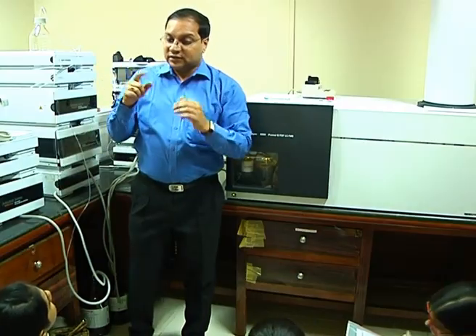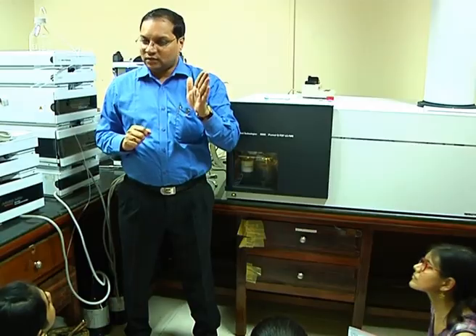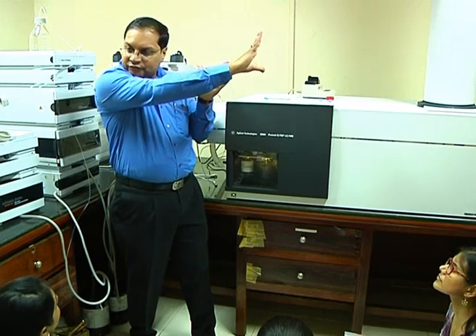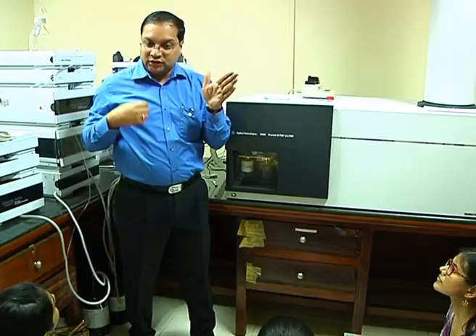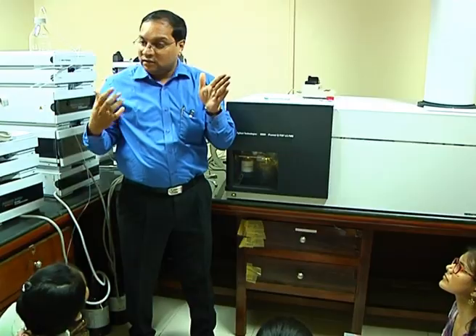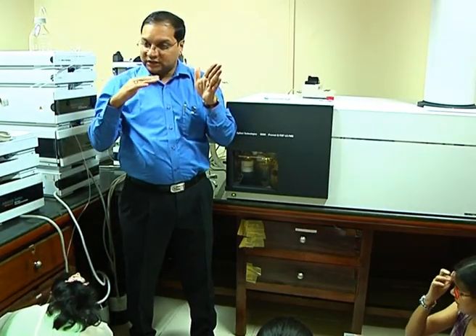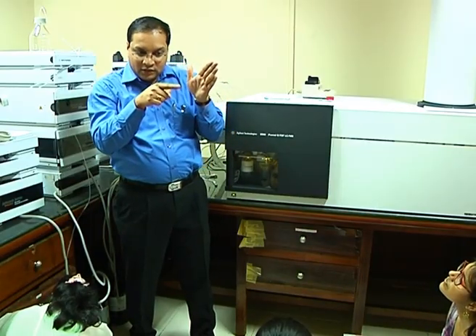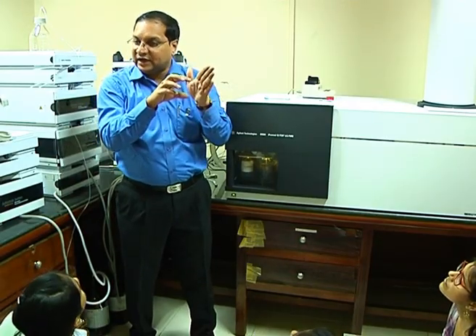In data dependent acquisition, this same scan time is split into two different experiments. Experiment 1 is to scan first, let everything go into the TOF, and in this scan, pick up the precursors based on the decision engine, depending upon the data which is coming. Meaning threshold, charge states, all those filters in place. If it qualifies, let us say 10,000 ions are scanned. Out of that 10,000, only 8 or 10 are relevant, are peptidic.